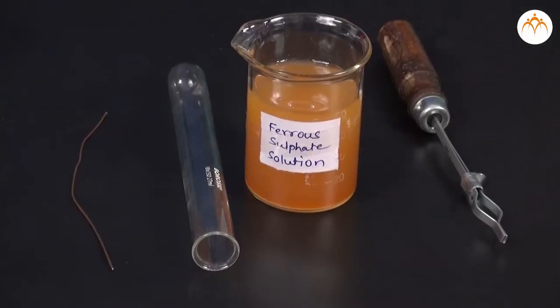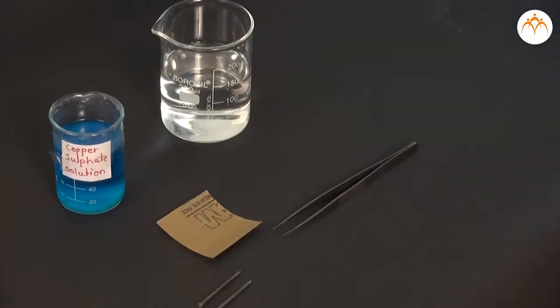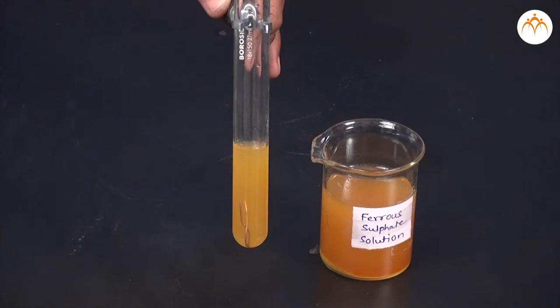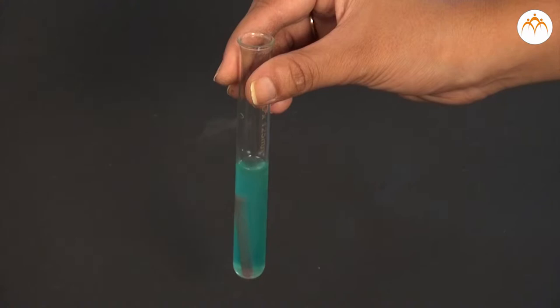Reaction of metals with other salts. Metals are not equally reactive. Take a clean copper wire and an iron nail. Put copper wire in iron sulphate solution test tube and the iron nail in copper sulphate solution test tube.